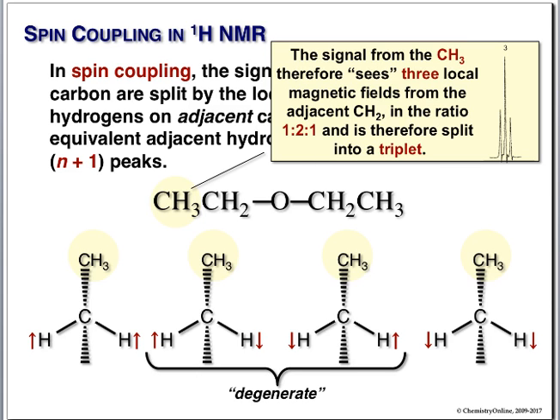Again, these 2 are the biggest, and these 2 are small. Quite often, see how these 2 aren't quite the same? Typically, a triplet or a quartet or something will lean towards the thing it's coupled with. Not always, but typically it will.